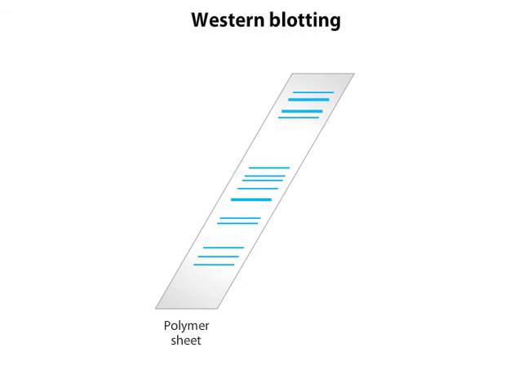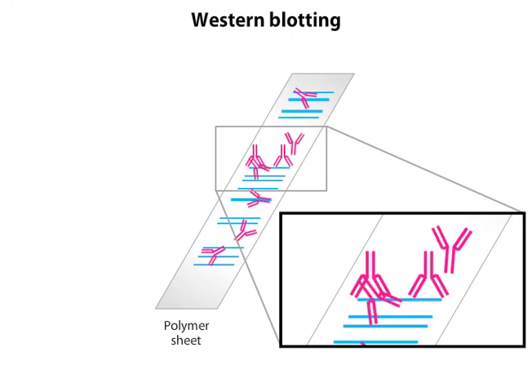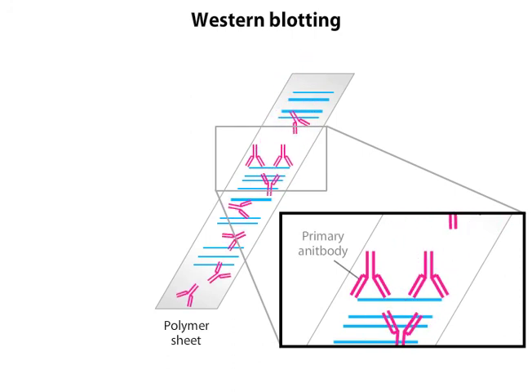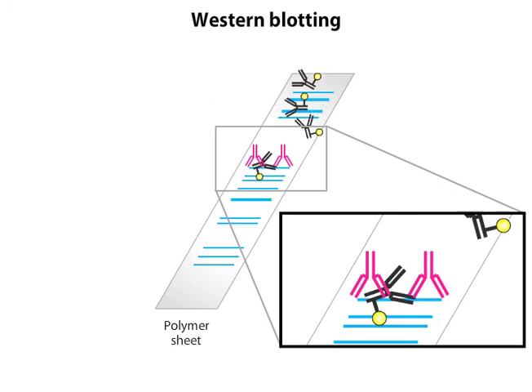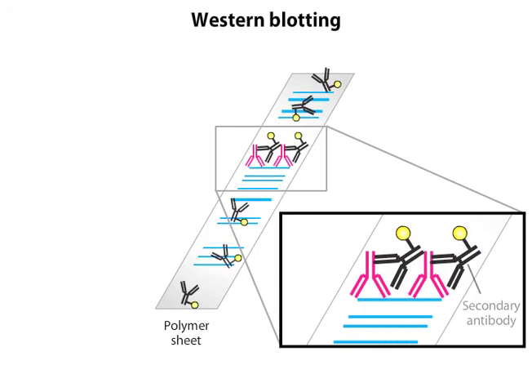Then, a primary antibody that will only bind to the protein of interest is incubated with the blot. After a washing step, only the primary antibody that is bound to the protein of interest remains. Several methods can be used to detect the antibody-labeled protein. All of these methods use a secondary antibody, which binds specifically to the Fc domain, or the tail region, of the primary antibody.